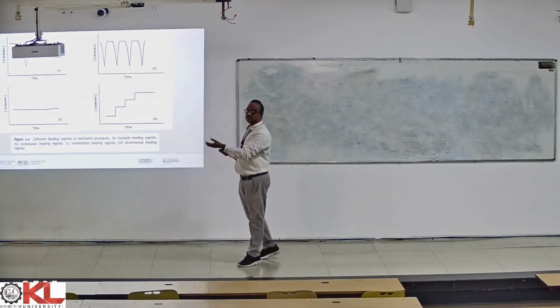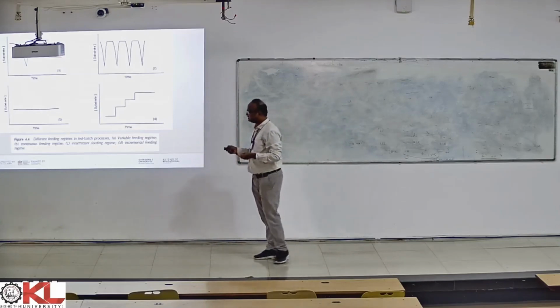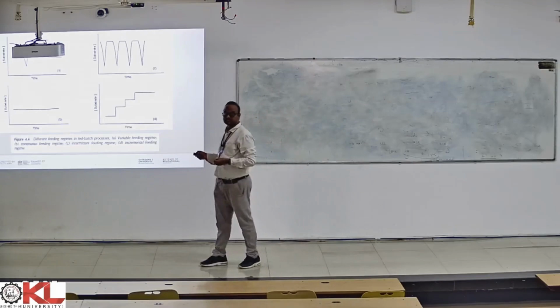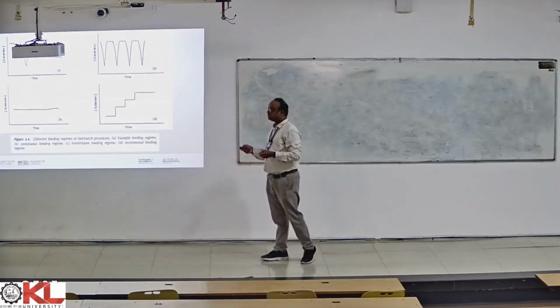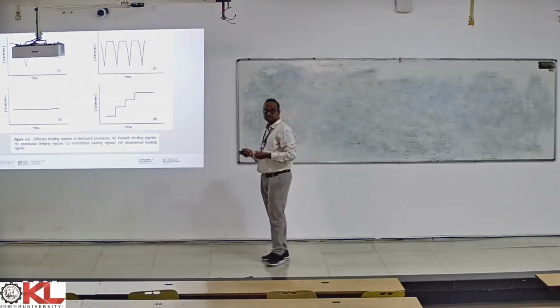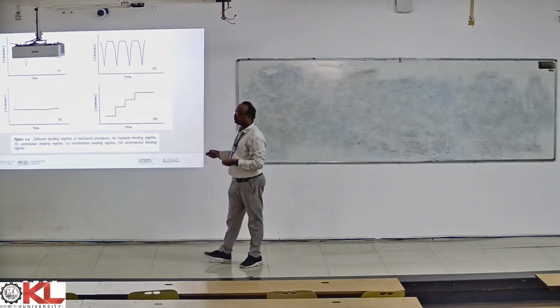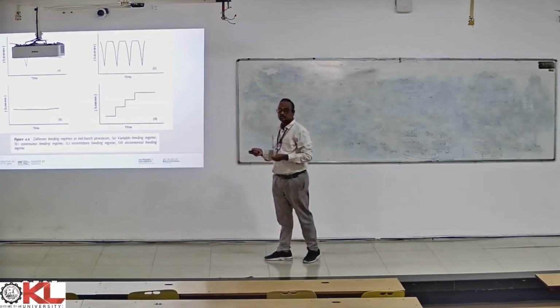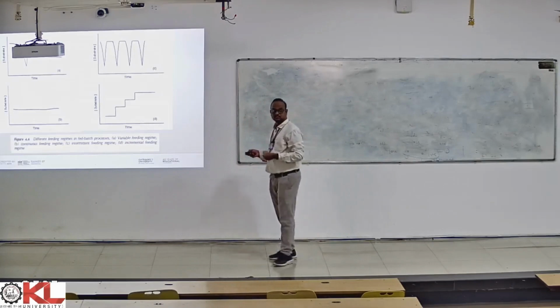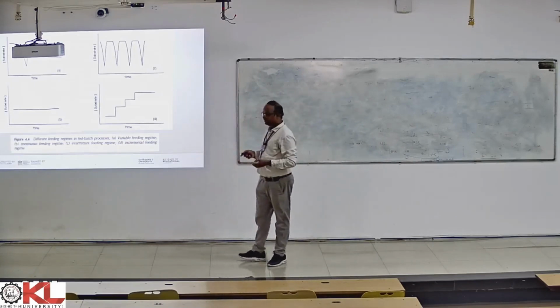Initially we have a small number of organisms going into the bioreactor, and slowly with time the organism count will increase. So we need to send more substrate into the bioreactor. This is also one strategy of operating in a fed batch mode.